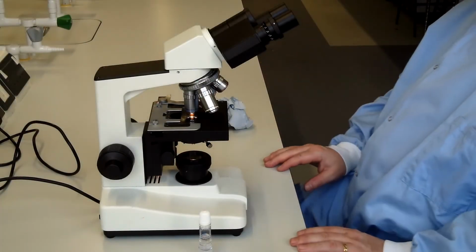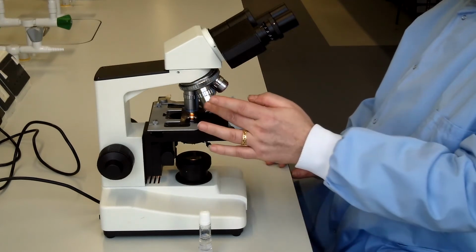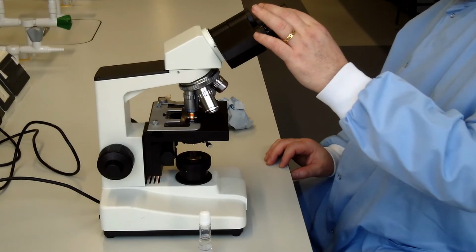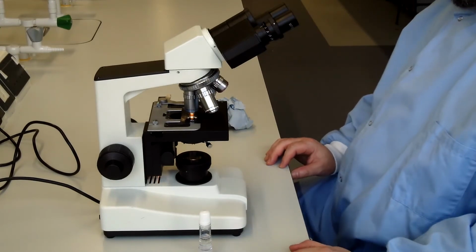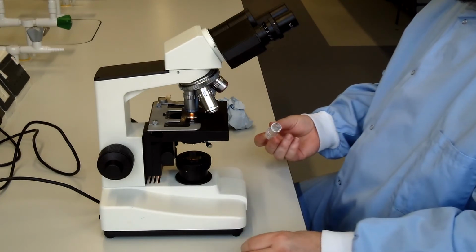Once you've identified an area you want to look at more closely, you can move to oil immersion. So this is the highest objective lens. It is a ×100 lens and has oil written on it. The eyepieces are ×10, so you'll be looking at the bacteria at a magnification of ×1000.